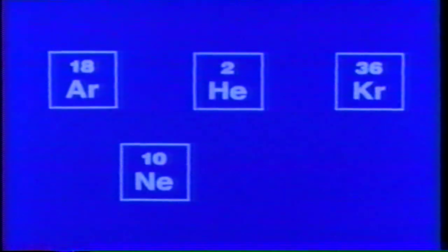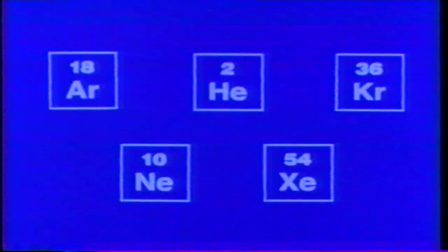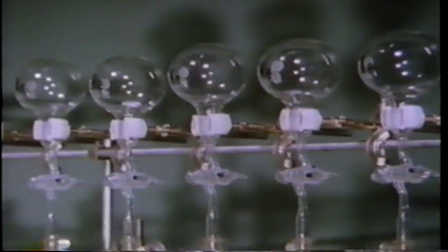Argon, helium, krypton, neon, and xenon give identical non-reactive results with lithium. We might tentatively classify these 5 apparently inert gases as a family of chemical elements. For almost 100 years, they were called the inert gases. You saw phosphorus react vigorously with air. Let's try phosphorus with these 5 apparently inert gaseous elements.